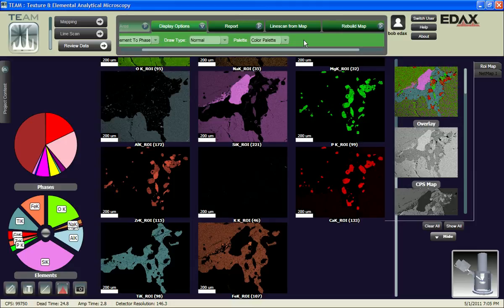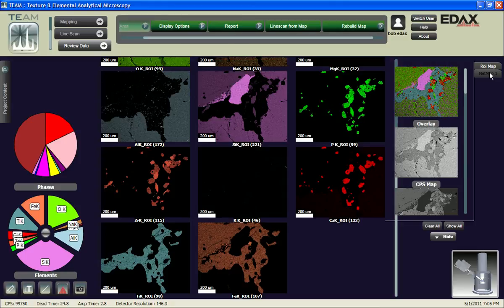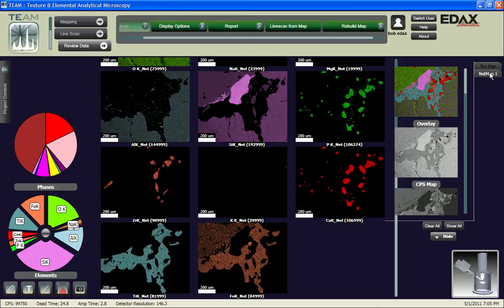The deconvolution really is the most significant effect, and we get that out of the net intensity maps. Also, doing the ZAF maps will take significantly longer, probably 2.5 times longer than it will take to do the net intensity maps all by themselves.